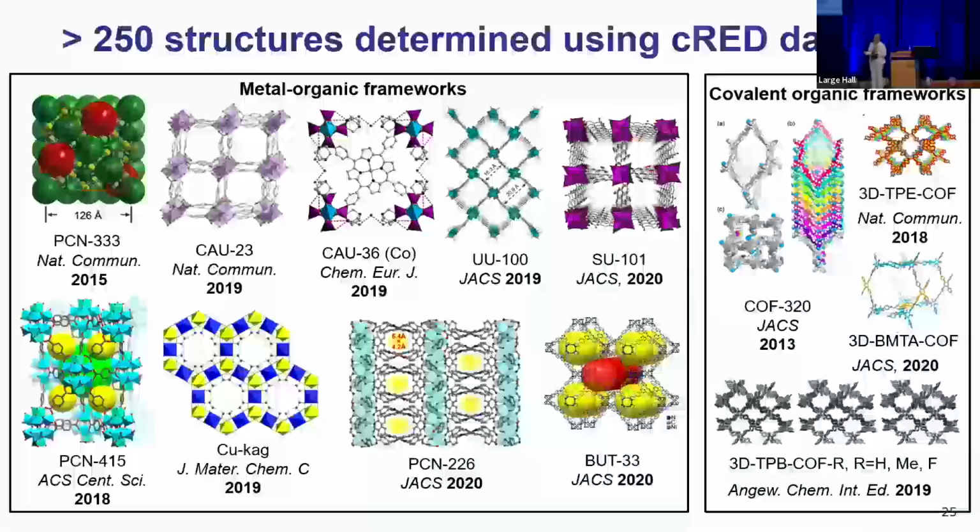And with this, currently the 3D data collection in our lab is quite routine. And so a lot of structures could be solved. We have solved more than 250 structures during the last few years. And it includes many MOFs, and also COFs, and even HOFs.